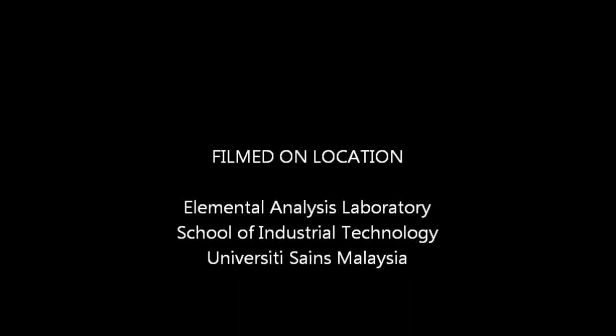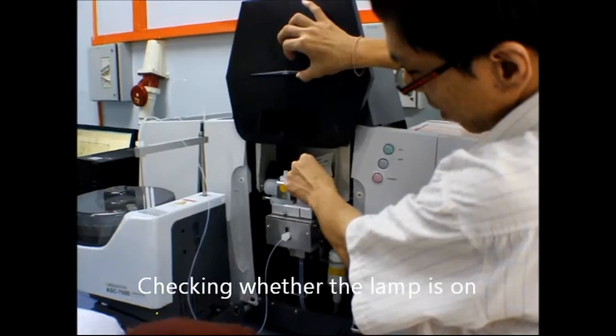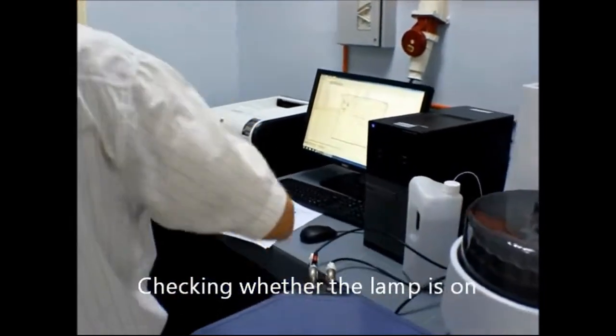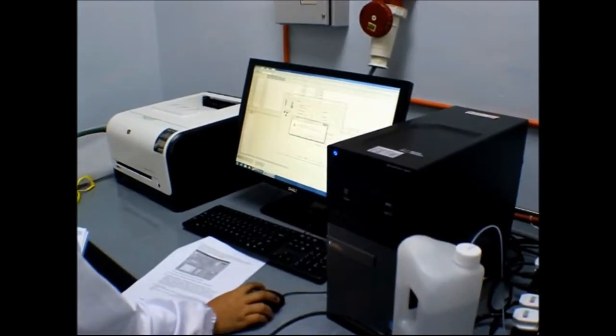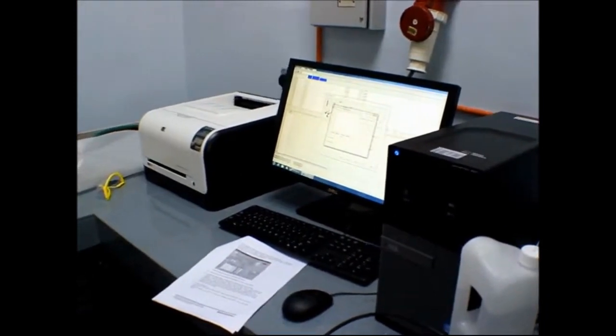Sorry, please transfer. Now the lamp is on. And then you do the line search next, okay.